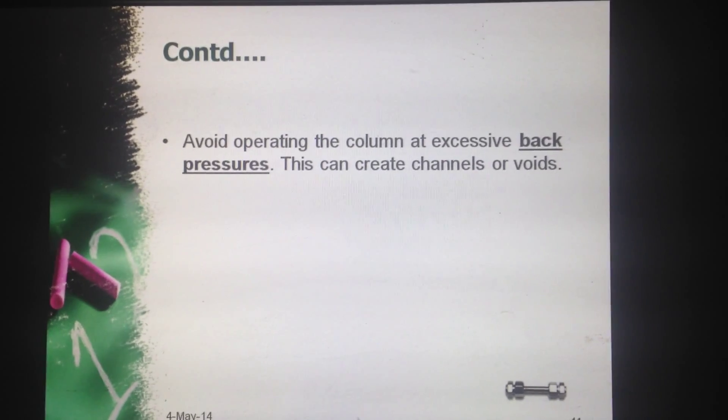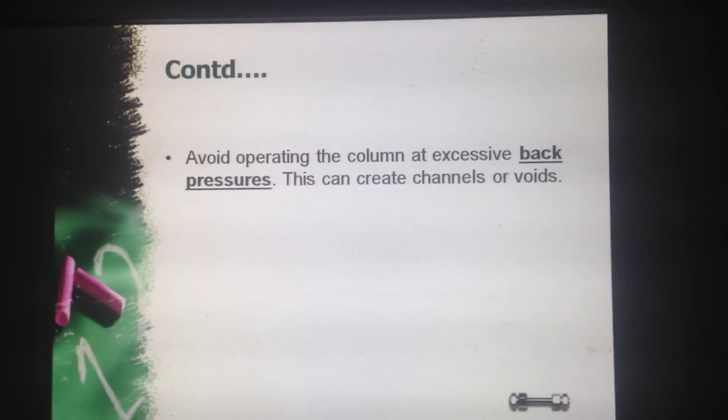Next point: avoid operating the column at excessive back pressures. This can create channels or voids.